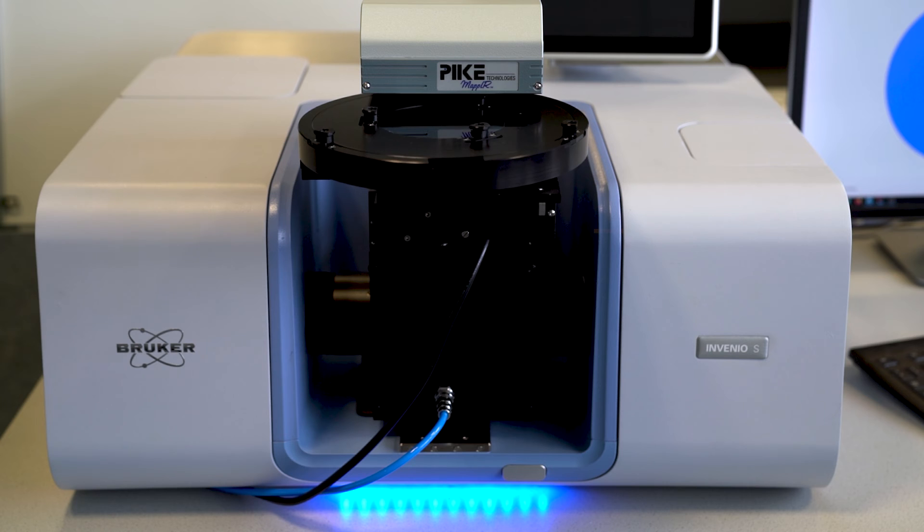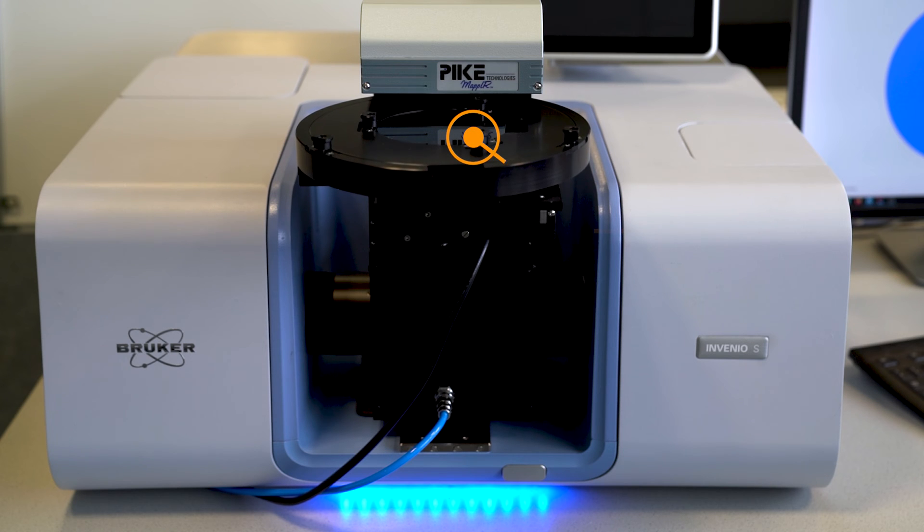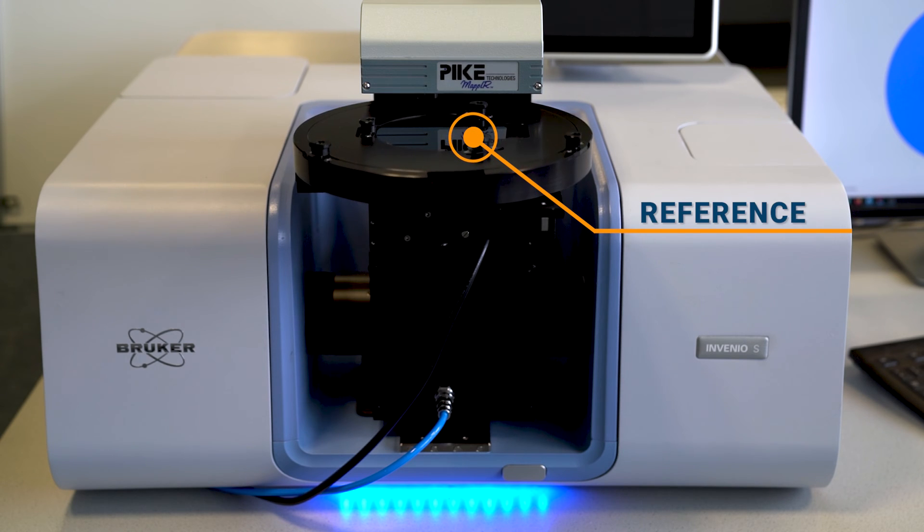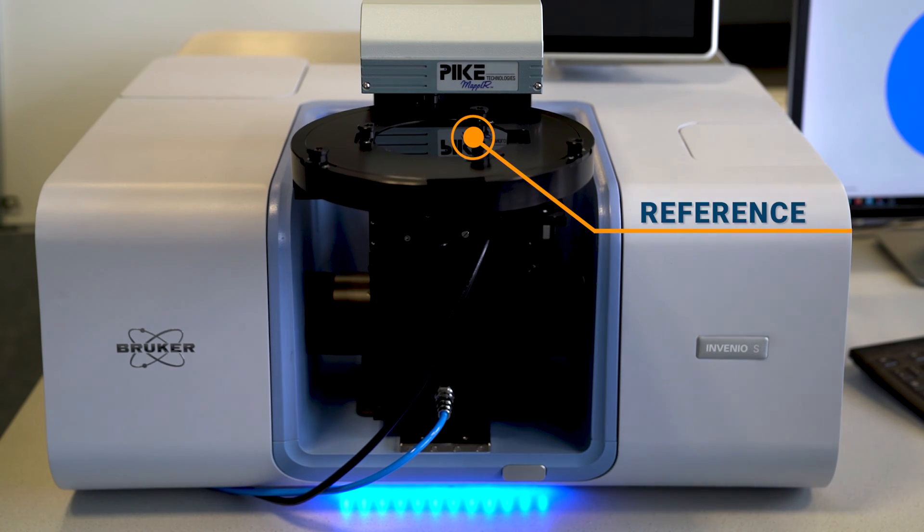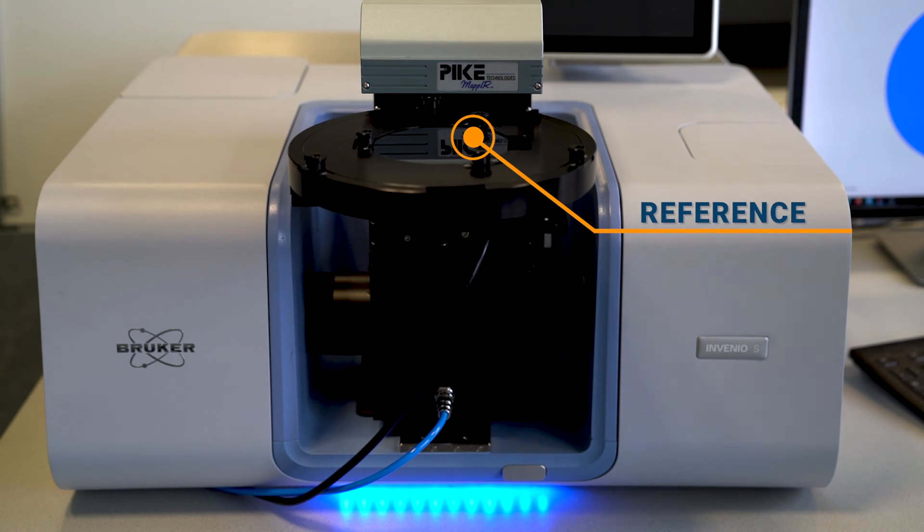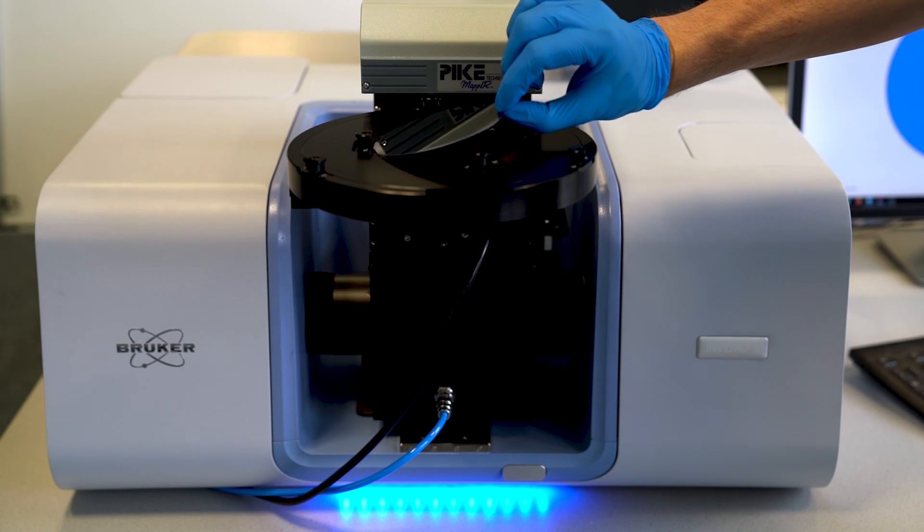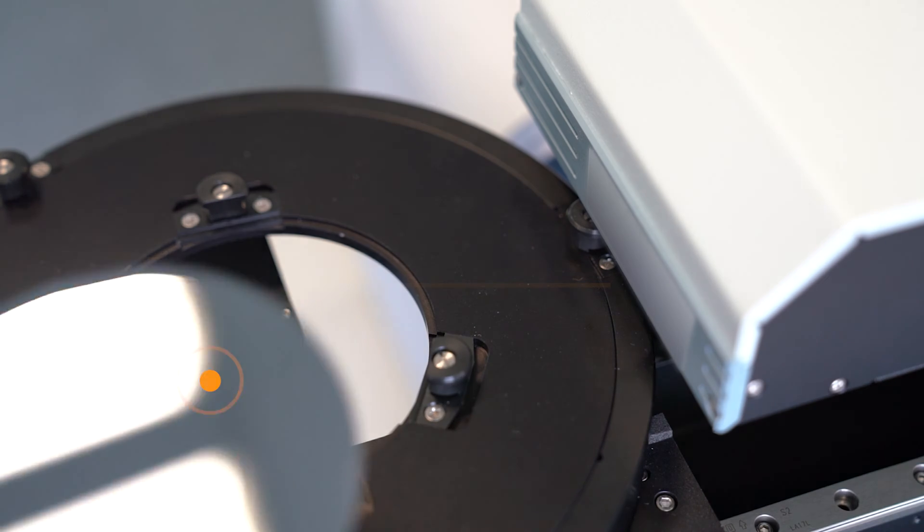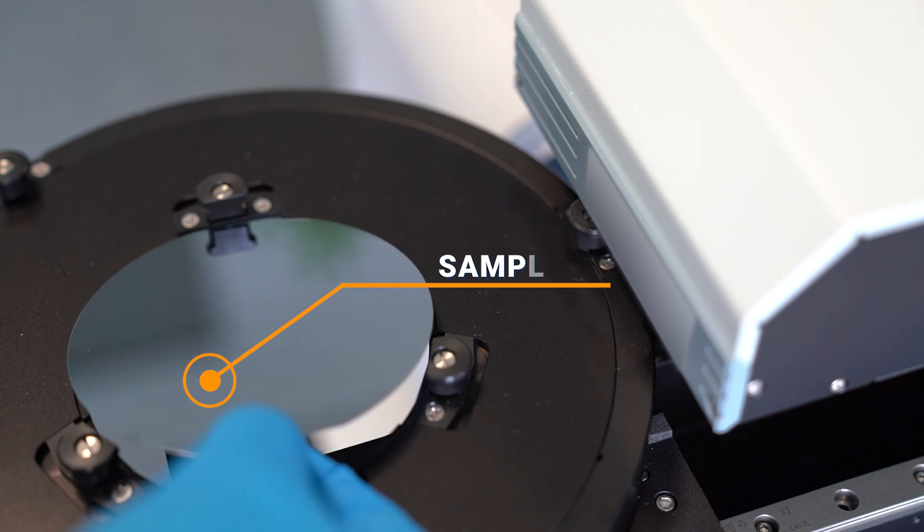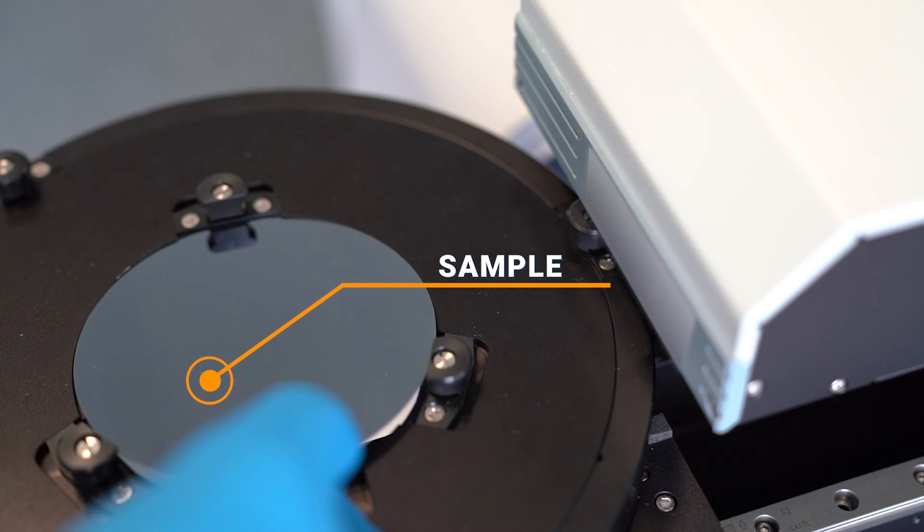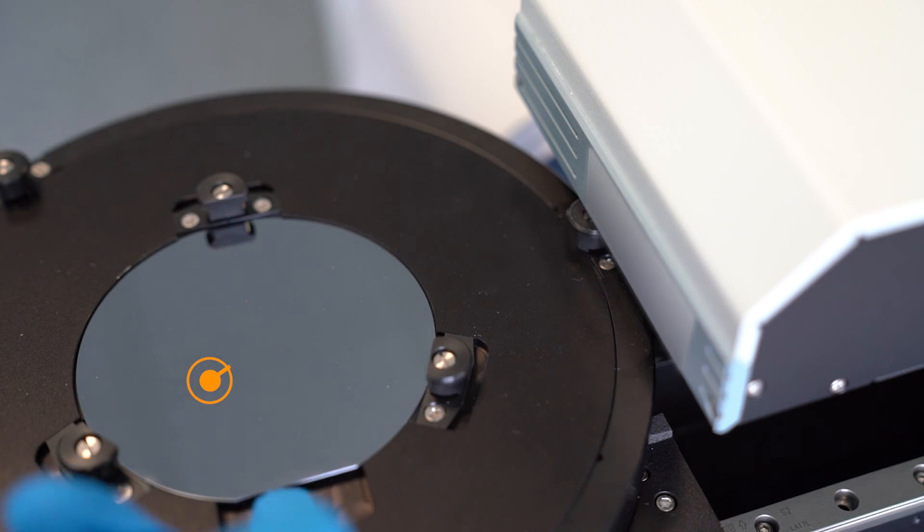The first thing we need to do is take a measurement of some reference silicon we know the composition of, and now we're ready to do the QC on this silicon wafer.